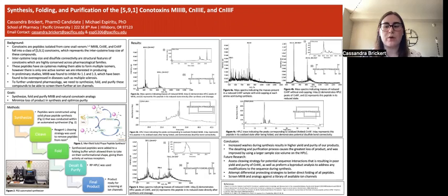The biggest thing I want to point out is that if you look at the HPLC inlay 1, the trace looks very messy, unlike the trace for M3B. There is no strong, obvious dominant peak, which means that this compound did not synthesize cleanly and our product has several impurities. There is still a lot of work to be done with this compound, and what we learned is we need to explore why the conotoxin is harder to produce and how we can form a cleaner product.